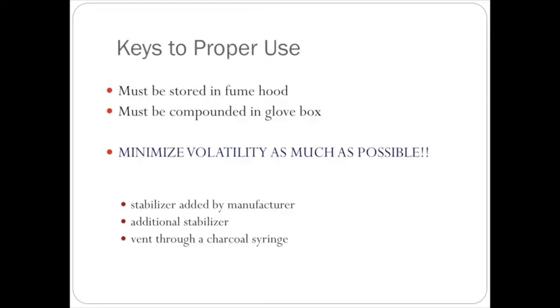The way that we do this in a nuclear pharmacy is most of the time focused on the equipment that we're going to use. So if you are actually going to be having I-131 in your facility, we don't just leave it out on a shelf or on a tabletop. It's stored in a fume hood, and that fume hood is going to be vented to the outside. And so basically any volatile iodine that actually is created in that process is going to be vented out.